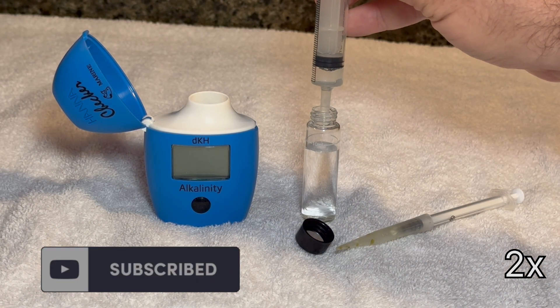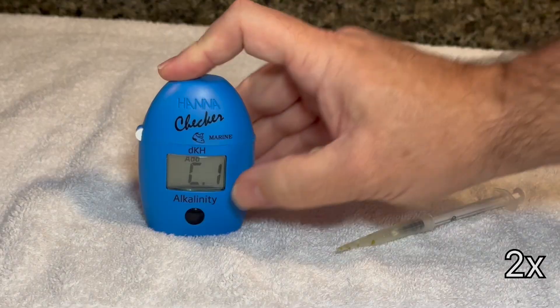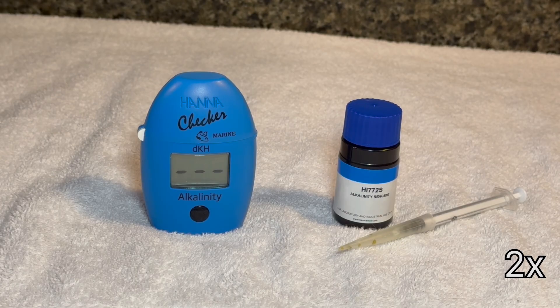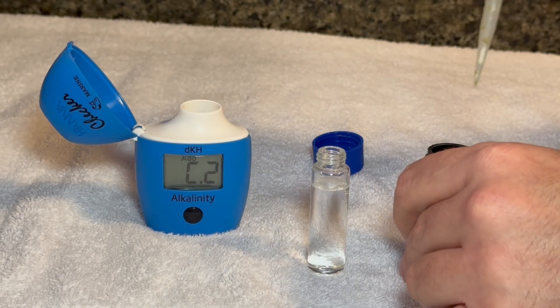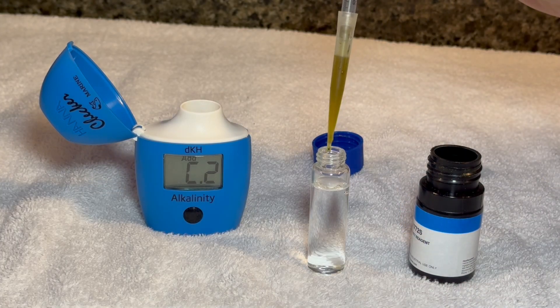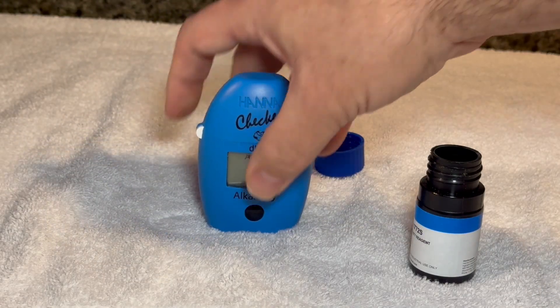10 milliliters of tank water is added to the cuvette. Then the device is turned on. A reading of C1 indicates the control measurement is ready to be taken. This means putting water in a cuvette that has not had reagent added yet. This sets a baseline so that the checker knows what truly clear water looks like versus the water that will have color added after the reagent is added to the vial. Exactly one milliliter of reagent is added to the cuvette, which changes the color of the water. The degree of color change is what's actually measured by the device to show us what the DKH is. After a little mixing, place the cuvette in the device, push the button, and wait for the measurement.